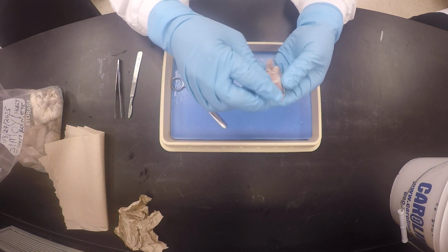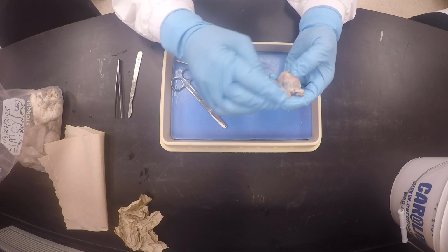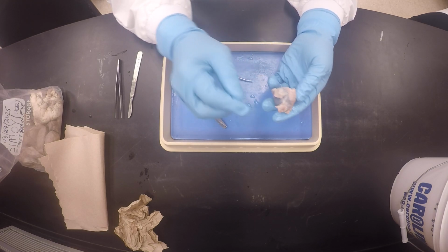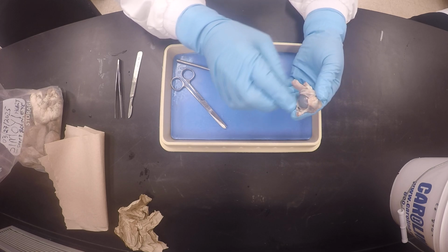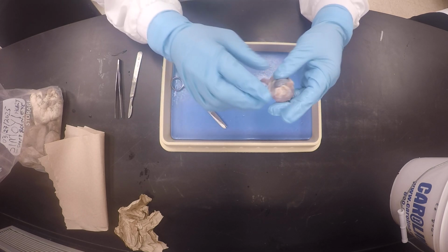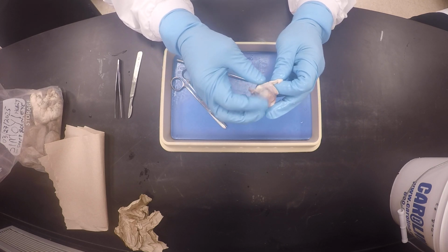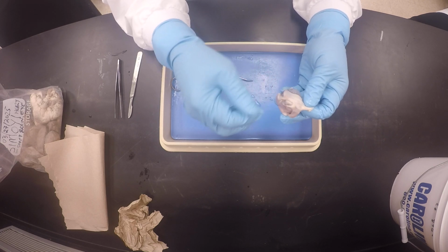So it's out of the movie. So we're scooting all these rectuses and obliques to the front, and I'm making a plan for my second incision, correct? So I'll be making my incision around here, but now at least I've got that set up. So again, let's do our little identifications here.